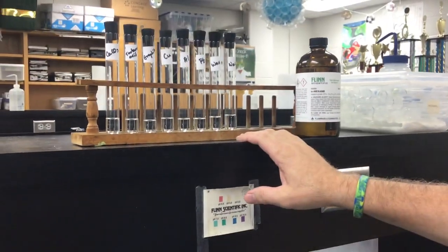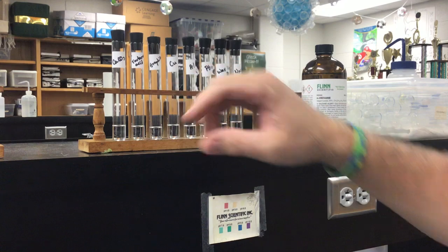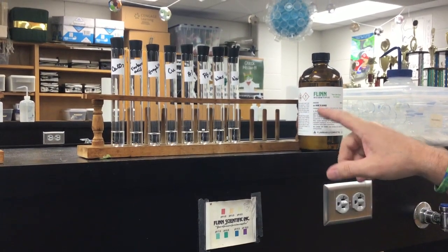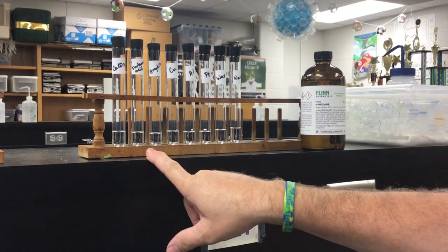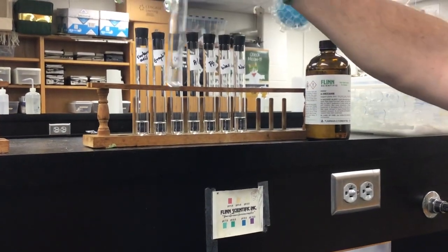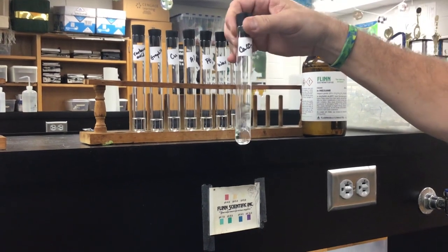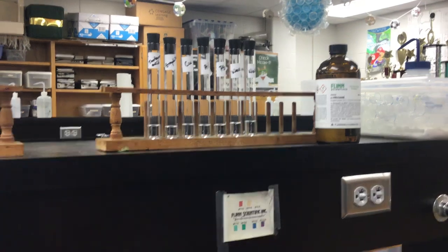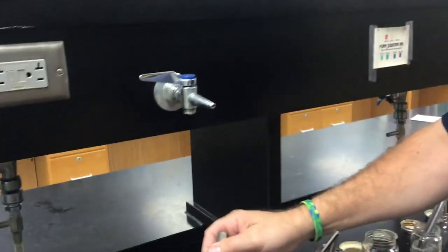So the third solvent actually, we did water first, and then we just did isopropyl. This one is hexane. And so this is just a bunch of different hexanes combined, C6H14. This is a nonpolar solvent. What we're going to do is put some of these in each one of these. I've already put enough hexane in each of these, about somewhere between 3 and 5 mils or so.